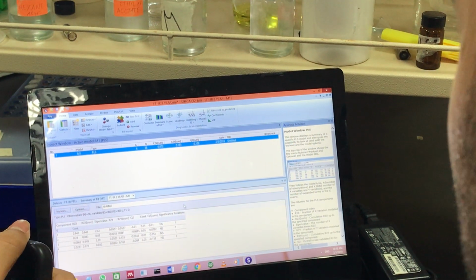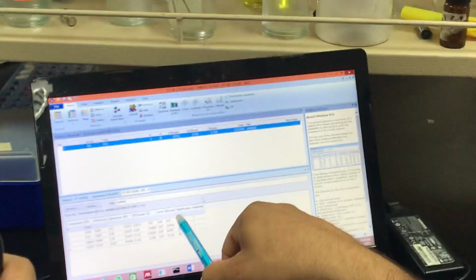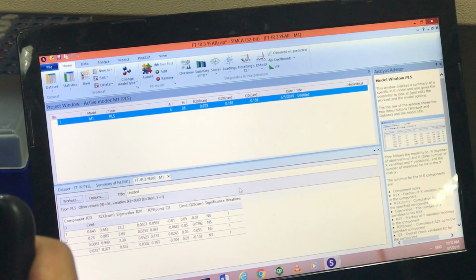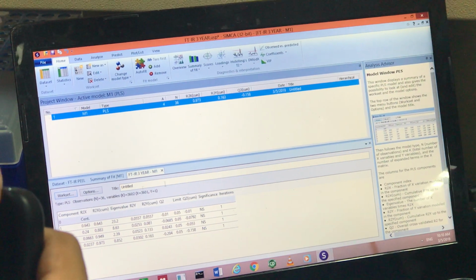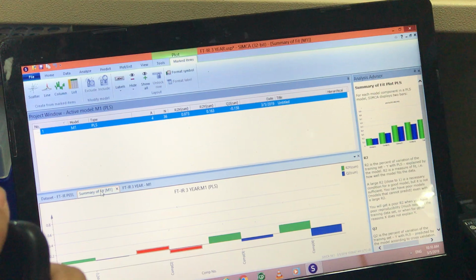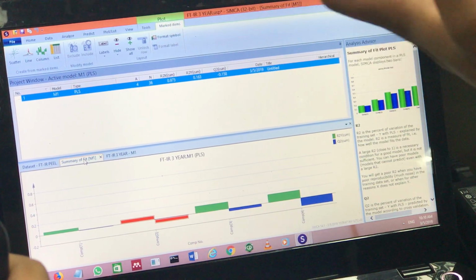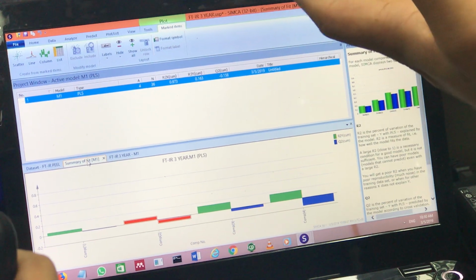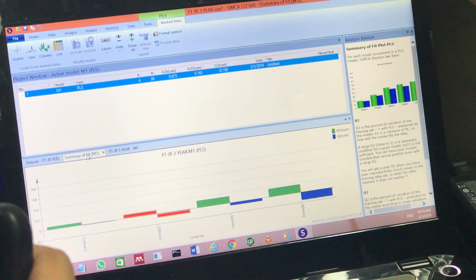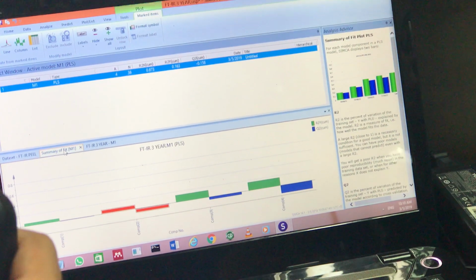You can see here there is no significance. Anas, you can see here, no significance in these components. But whatever, because there is no purpose of application, it is only for undergrad. I just want to let you know that if the software is not able to see the difference among the samples, it will not be able to process the data. If there is a difference, then we can go further.